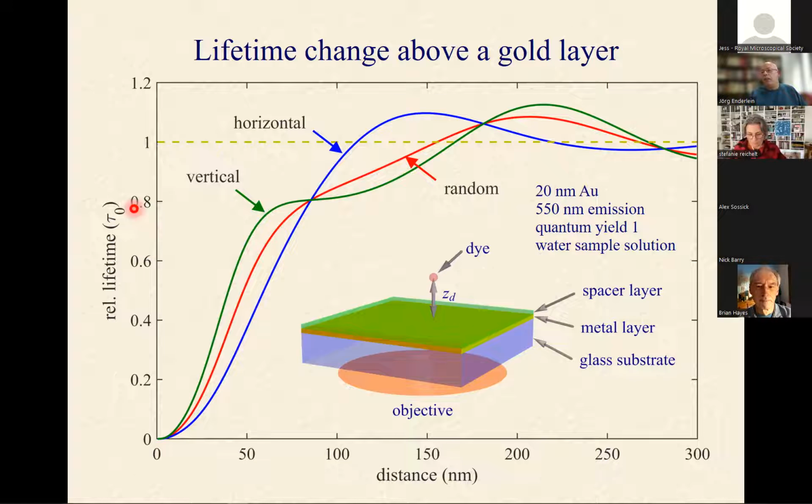The beauty now is that we are completely independent of intensity measurements. So what we can do is simply take our emitter and image it with a fluorescence lifetime imaging microscope, which I show you in the next slide. And then we know the lifetime, and we can use these curves here to back-calculate the distance from the surface. Of course, what is also seen here, in the same way as before with the soft microscopy, is that this effect is orientation dependent. So theoretically, you should know exactly how your molecule is oriented with respect to the surface. For a vertical dipole, the green curve, you see a different dependence of lifetime versus distance than for the horizontally oriented molecule. Fortunately, in most of our applications, when we do bioimaging, our molecules are coupled to structures of interest with a very flexible linker, so you can use the random orientation, because the molecule is reorienting all the time in space, and that's why the so-called random curve for the isotropic emitter is an excellent approximation of the true situation.